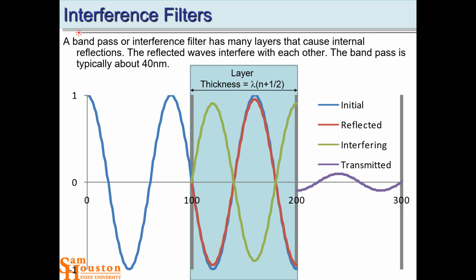And then if some energy is coming off at other angles, it'd really be a cone. If you've got a laser coming in, it'll be a cone, and there'll be a bright ring, and that bright ring has all the energy that's missing. So this filter doesn't absorb energy, is my point. The filter redirects the energy to other angles. It's a monochromator is what it is.